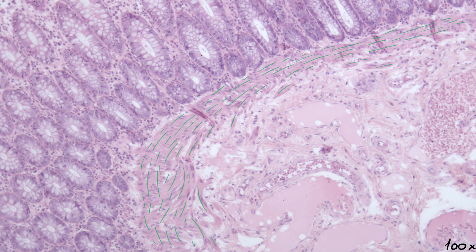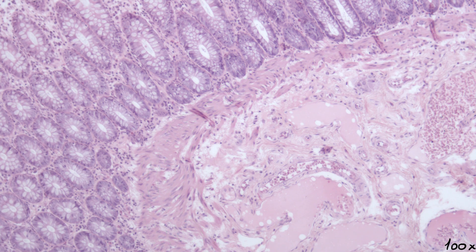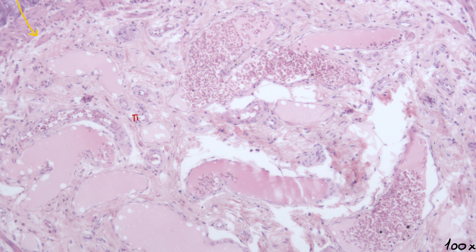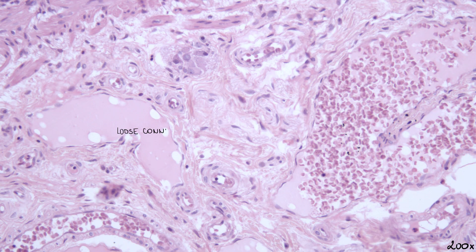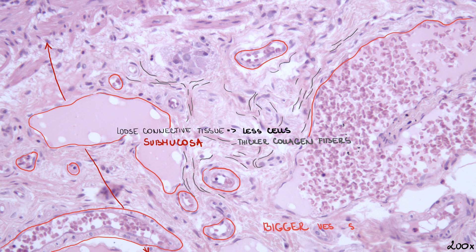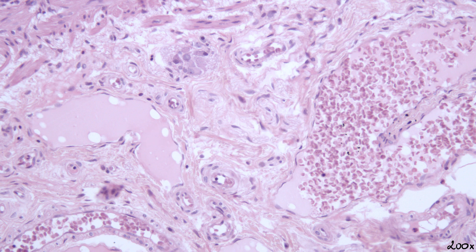The third layer of the mucosa is the muscularis mucosae, which is made of smooth muscle cells. The next layer, located under the mucosa, is called the submucosa. Submucosa is made of loose connective tissue, just like lamina propria, but it contains fewer cells. On the other hand, it has thicker collagen fibers and larger vessels. One important structure to remember is that it contains a nerve plexus called the submucosal, or Meissner's plexus.